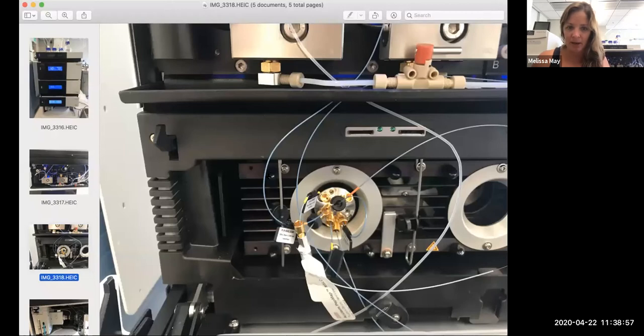And so this is this line right here, which is going into position three, I believe, is going to be carrying loading buffer, or not loading buffer, our solvents A and B into the instrument. And that is going to flow directly into our column, which is in this one, and then go straight onto the mass spec. I don't have this hooked up right now, so it's kind of hard to see. We also have in here in positions, where's the trap column? 2 and 5, so here and here, there's this little loop, and you can see this.